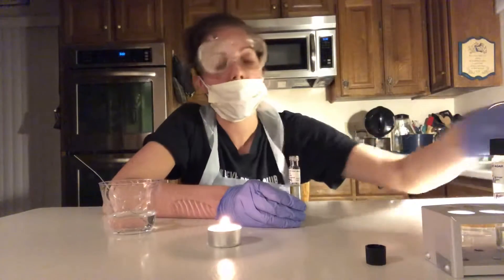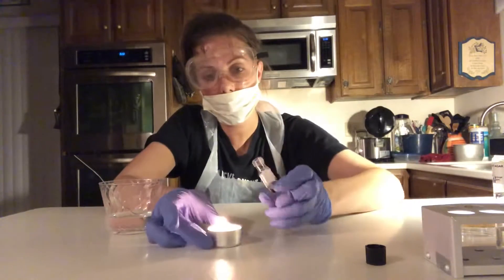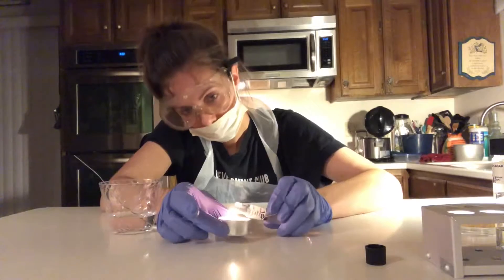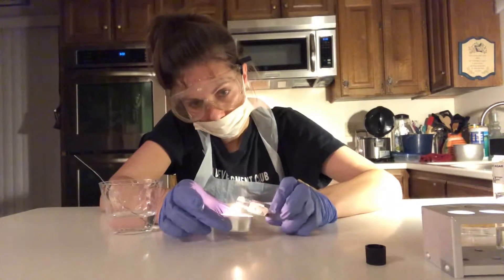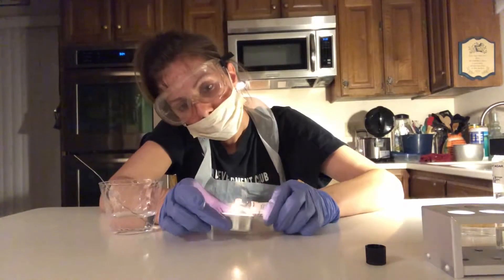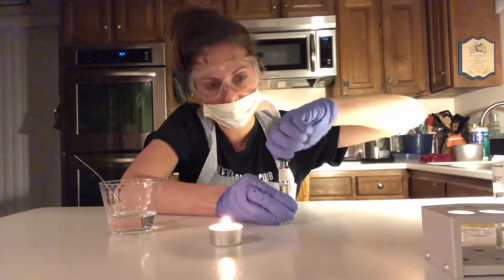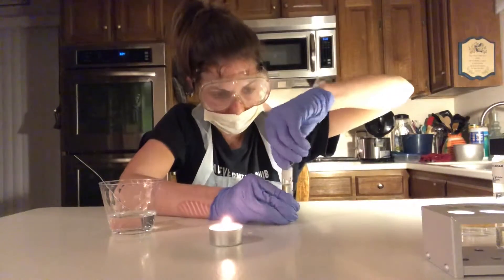Now I'm going to sterilize the lip of the tube using the flame again and then put the cap back on.